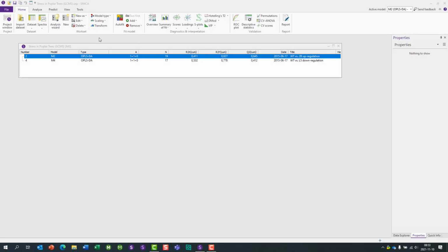Hello and welcome to this how-to video on how to operate the omics skin inside the SIMCA software. In this video we will target some of the tools that are available under the validation group: the ROC plot, descriptive statistics, permutations, CV ANOVA and CV scores.